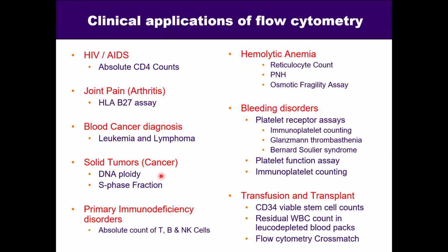In clinical, clinicians and pathologists use the flow cytometer. You must have seen the many pathological assays they do, and they run the patient samples and get the reports.